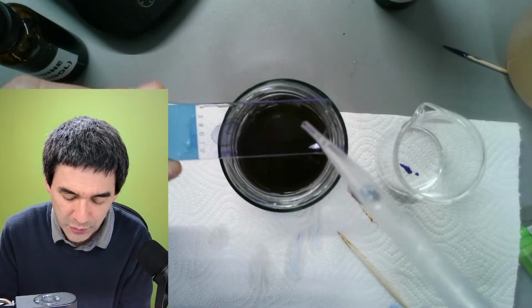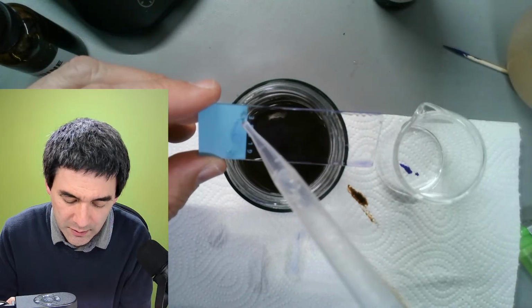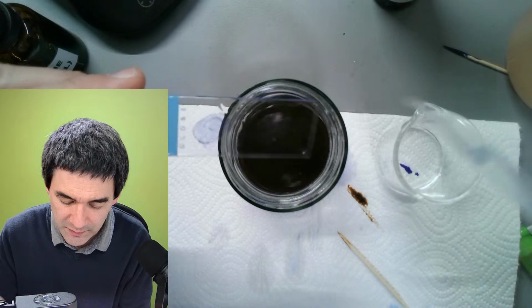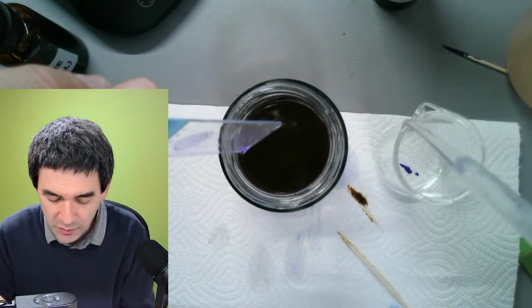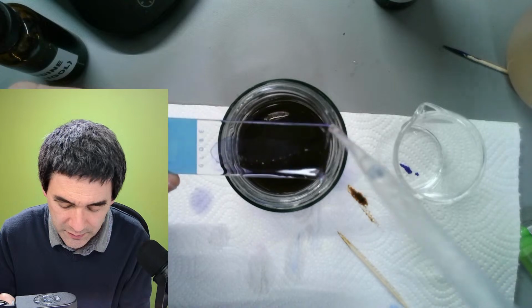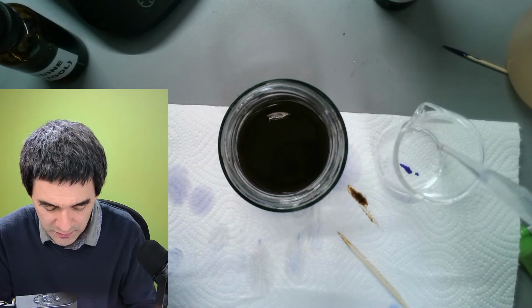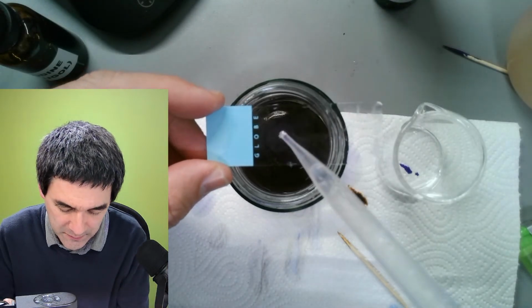And you have to keep on doing this until no more stain is washed out. But I think this seems to be okay. It's a little bit purple still. Maybe one last time.